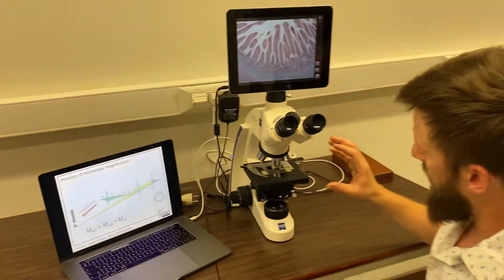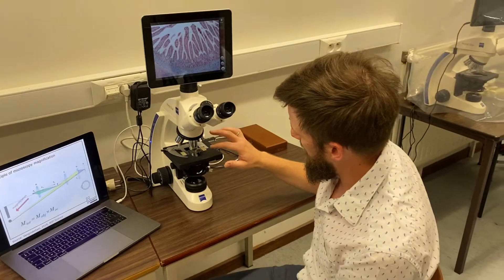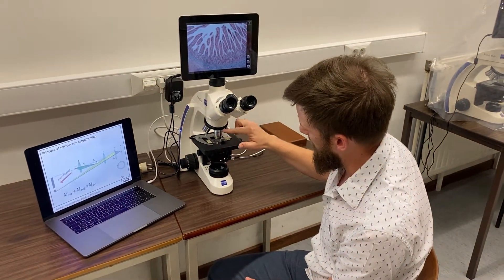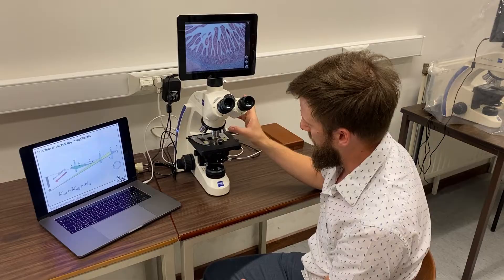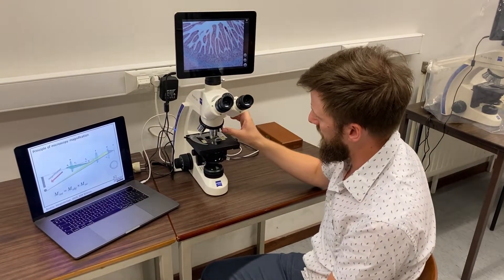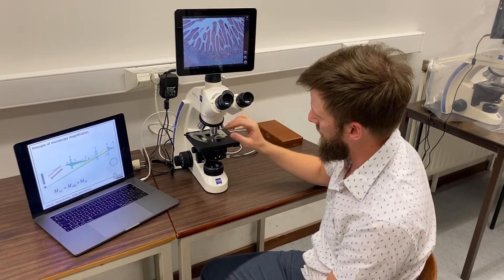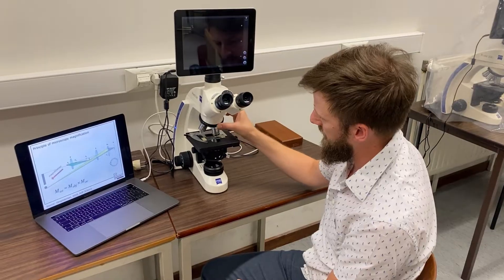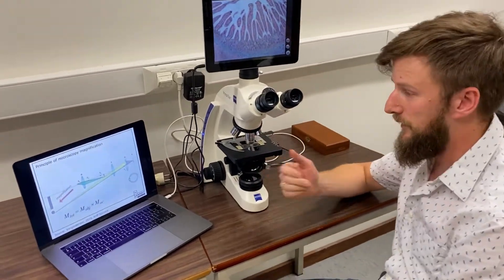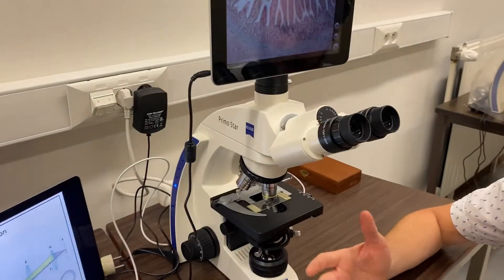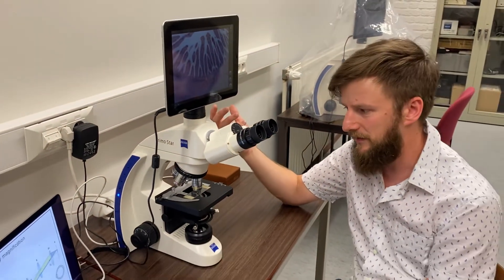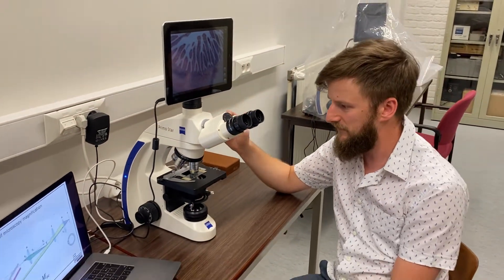Going back to our microscope, the objective lens is positioned here. This is typically part of the large majority of microscopes. The objective lens is part of an objective revolver that you can see here and that you can turn. It contains objective lenses with different magnifications. Magnification is not the only specification on an objective lens.